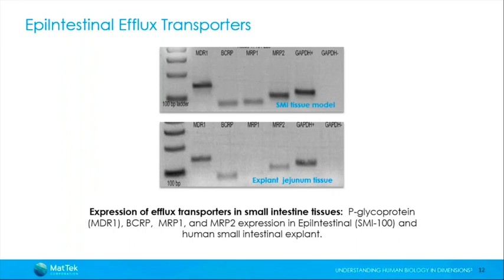The major drug efflux transporters are shown here for P-glycoprotein, MDR1. The top panel is our tissue model, and the bottom one is explant tissue. So they express the efflux transporters in a similar manner to the explant tissues.